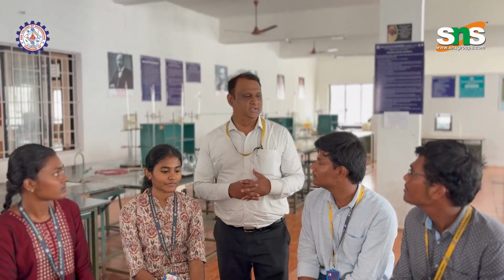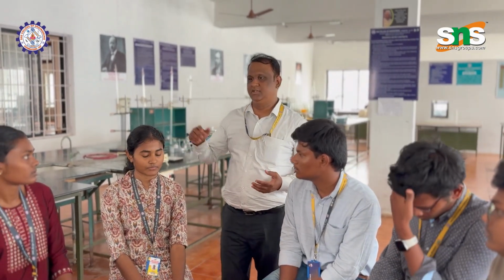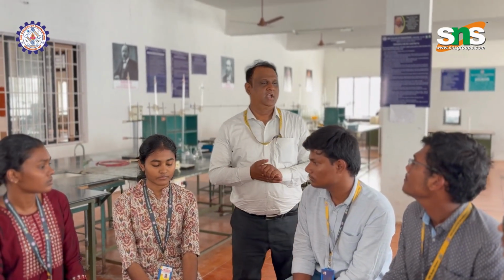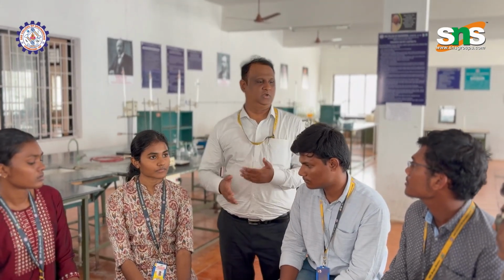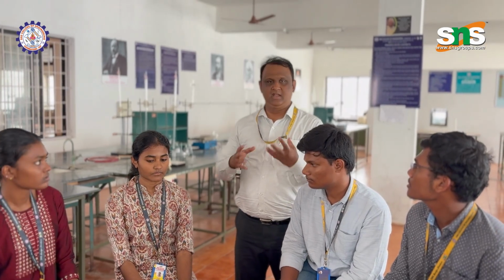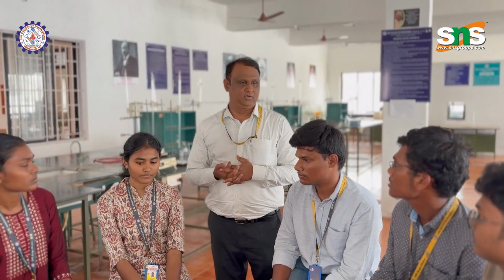Okay. Dear students, today we discuss a particular type of titration. So we have several types of titrations. One is volumetric, another one conductometric, then we have potentiometric titrations. Every titration or every experiment has its own advantages and disadvantages. First, I want to understand how much you know about conductometric titrations. So why do we need a conductometric titration instead of an ordinary volumetric one?